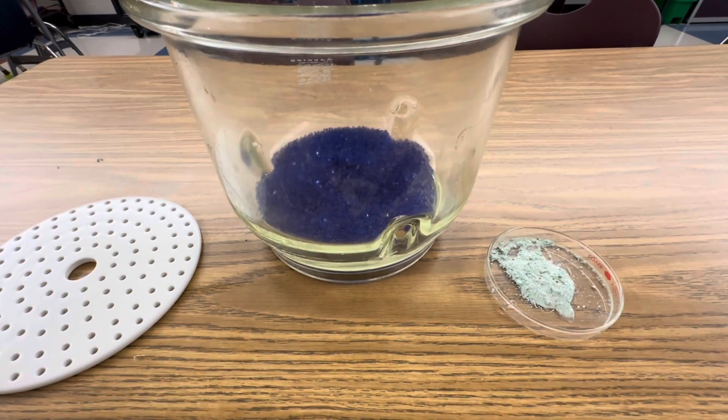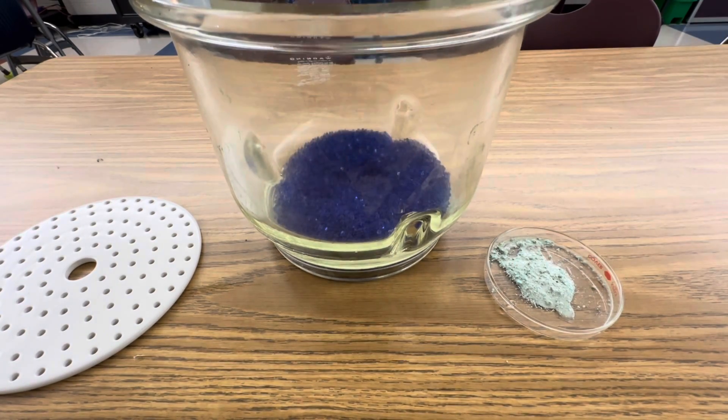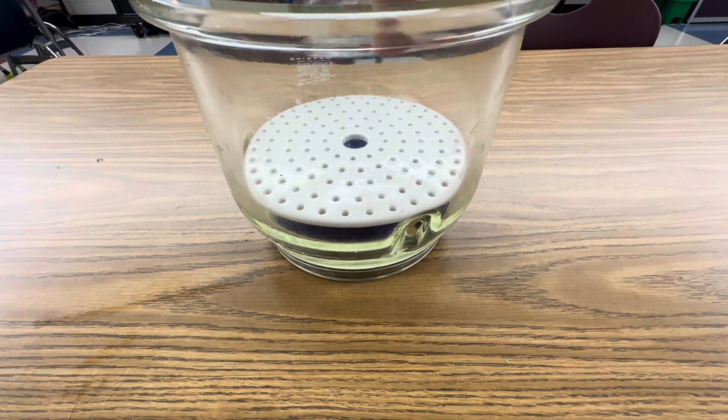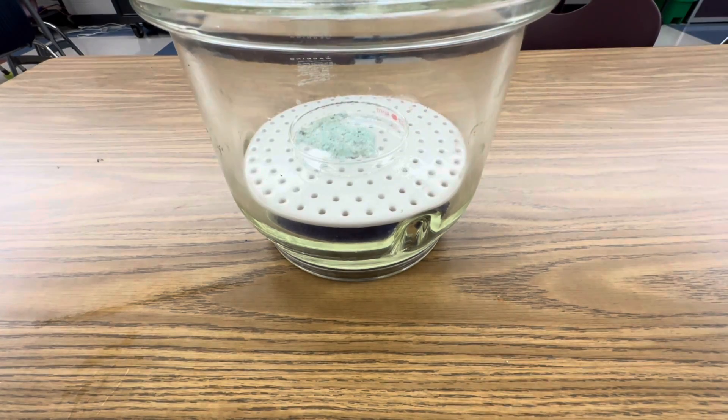To get my bismuth 3 nitrate crystals nice and dry, I added some fresh desiccant to my desiccator and I'm going to put this dish in here and just let it dry for a few days.